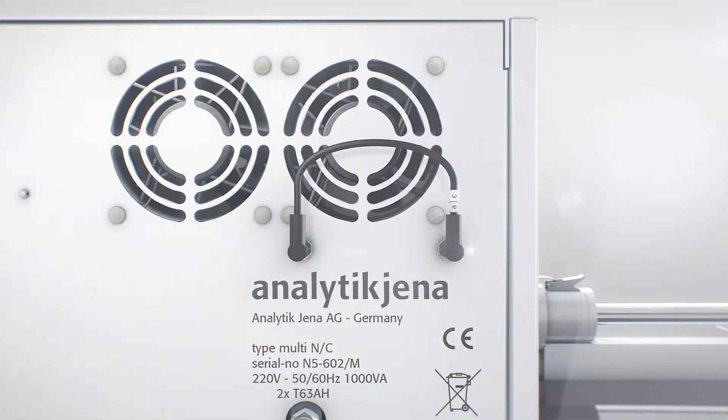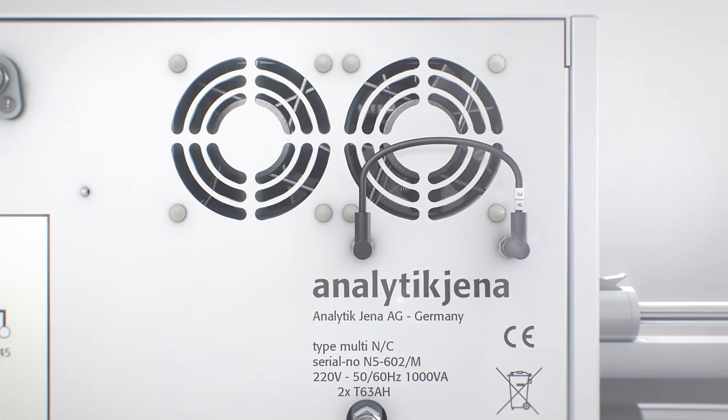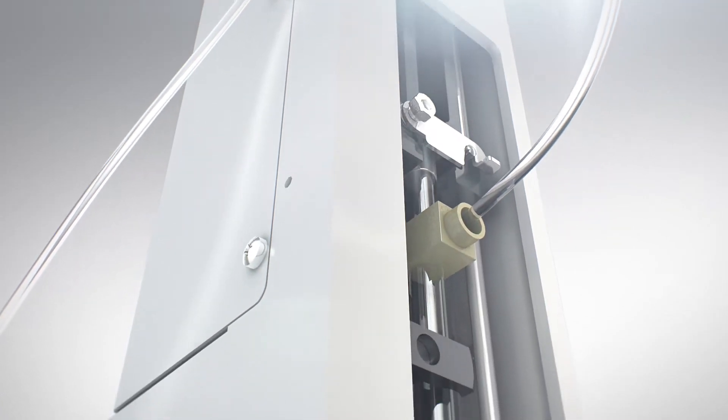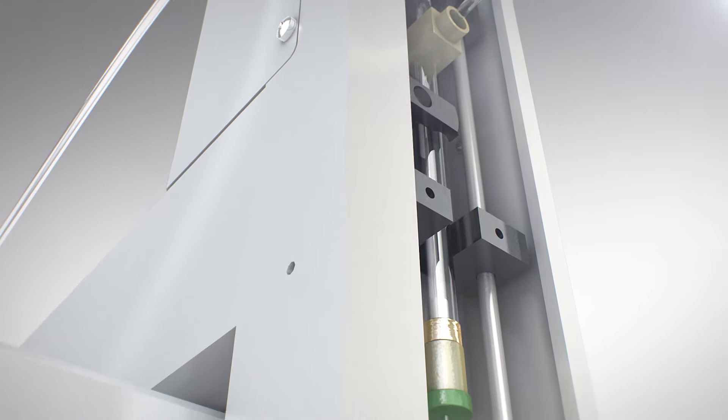NPOC, TNB, POC, TC and TIC in liquid or solid samples, in one instrument without any conversion, quickly and precisely.